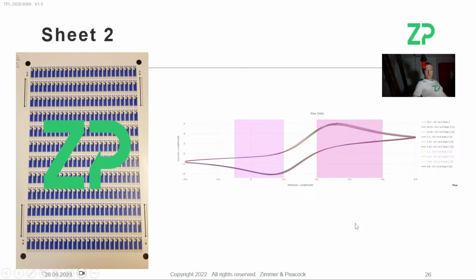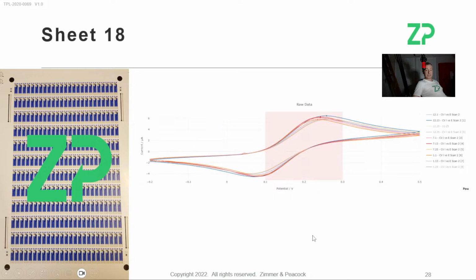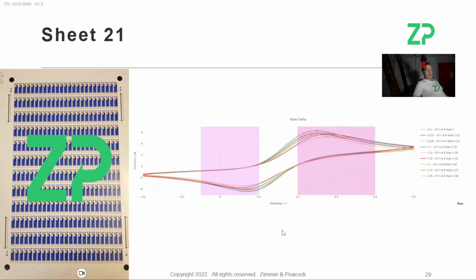Sheet two, we will check it, make sure that everything is fine. This is, by the way, several electrodes. These are not the same electrodes retested. These are several electrodes from the sheet. We'll test another sheet slightly further into the print run. Again, this is not one electrode. This is several electrodes being tested. We'll test another sheet of electrodes into the run, make sure everything's reproducible, and we'll also test sheets later on.